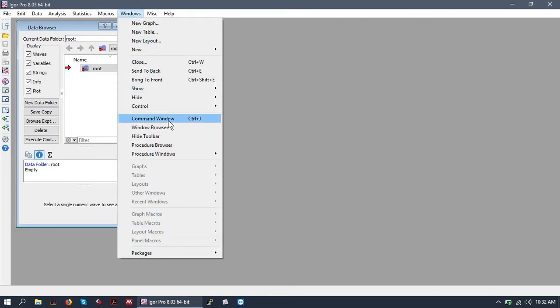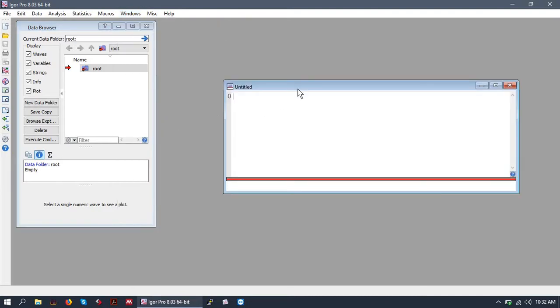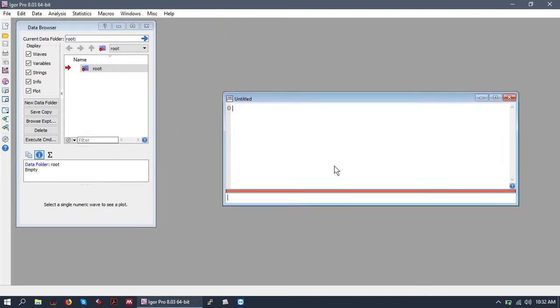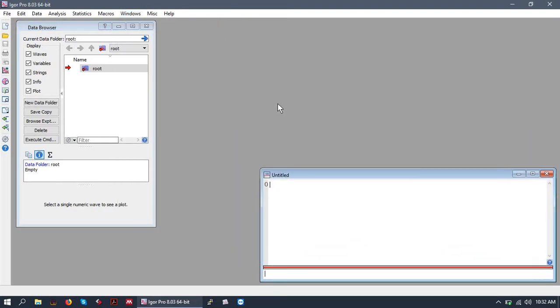Next, we'll open the command window under Windows, Command Window, or Control-J. And that's how we open those windows up.